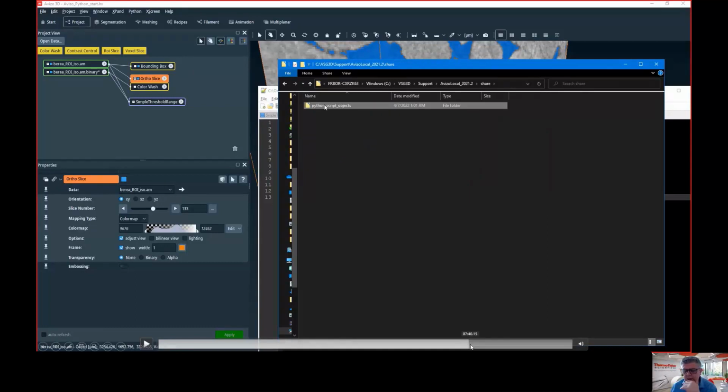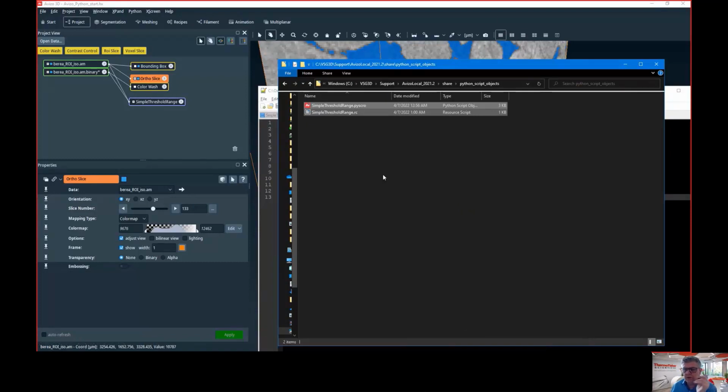We can skip a little bit of detail, but let's say it's documented as well. If you create an Avizo local directory with the right structure and you instruct Avizo to look into this directory, you can inject into it everything to extend Avizo. It could be TCL, C++, Python, plenty of things. So the Avizo local concept is that every user can have his own Avizo local directory with extensions to Avizo.